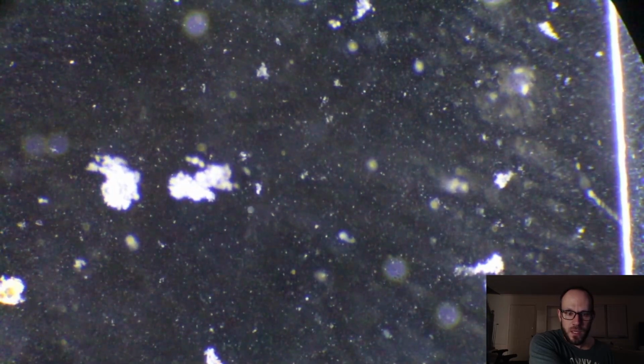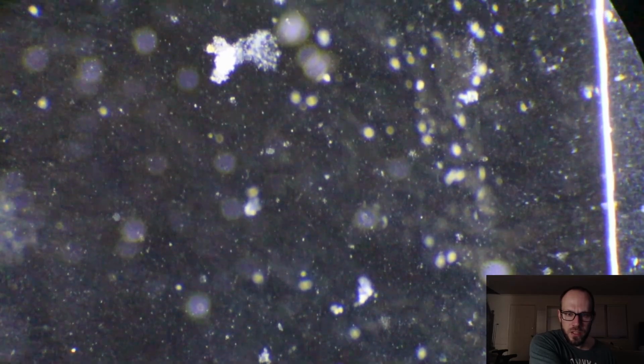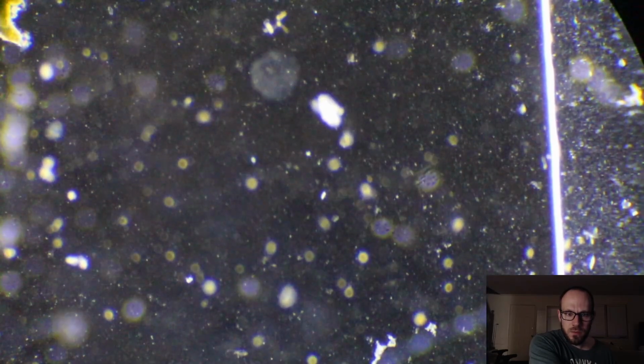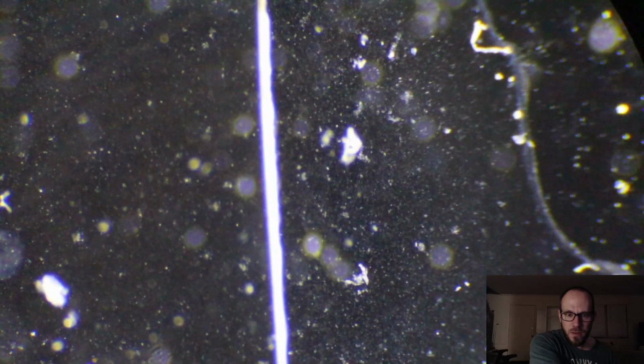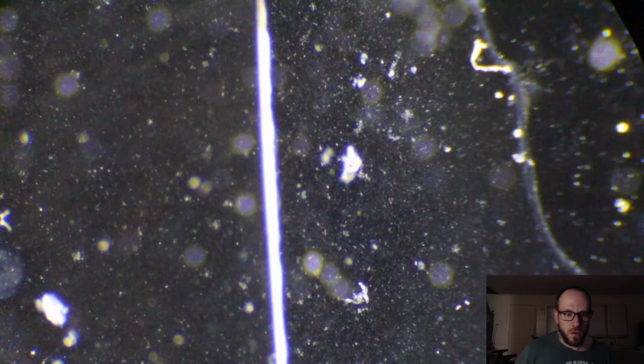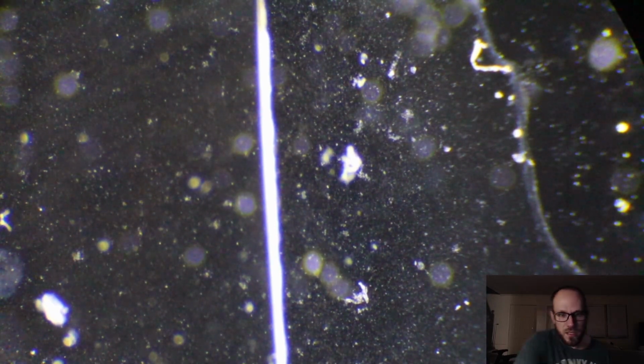You can still see the tiny, tiny legions swimming, but nothing of substantial size. And that dead rotifer was really ominous, even in the water outside that I touched with my hand and then sanitized because it was gross. Good thing too.